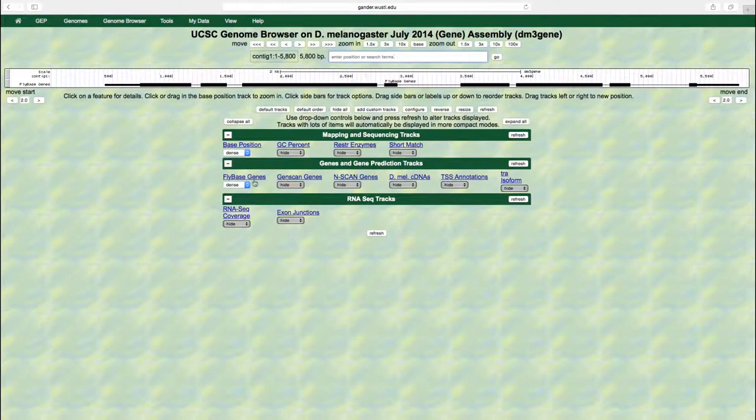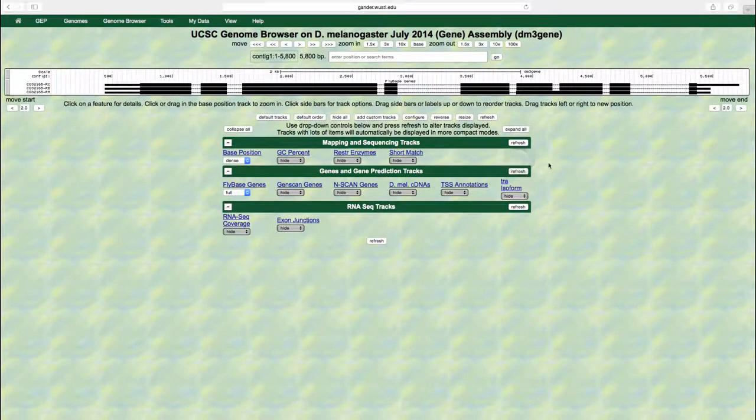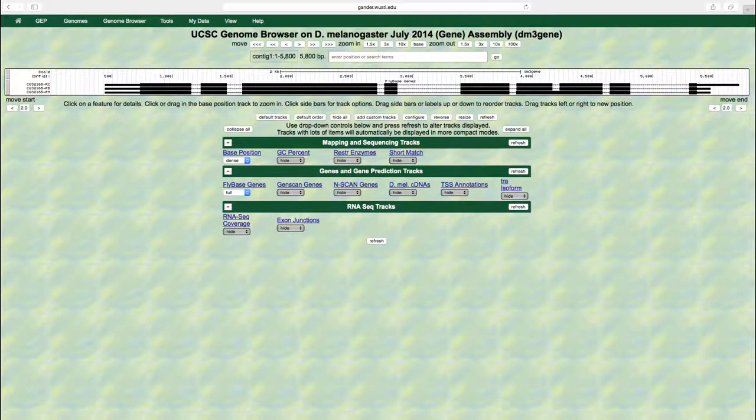Change the display mode for the FlyBase genes track to full and then click on the refresh button. Now we can see that there are three sets of exons and introns that correspond to the three isoforms of the gene CG32165. An isoform is an alternative form of a gene that results from alternative splicing, or the use of different sets of transcribed exons in the processed mRNA.